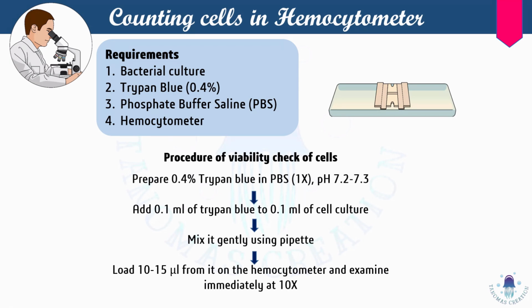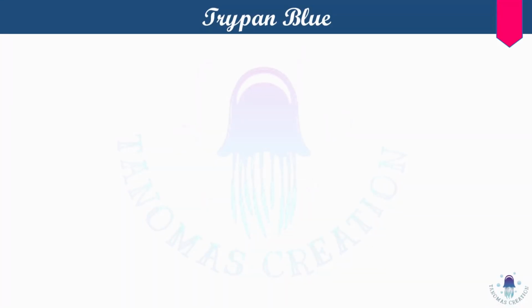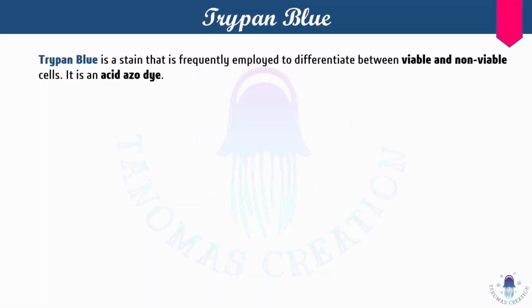Okay. So what does this Trypan blue do actually? Why are we using this Trypan blue? So this Trypan blue is basically a stain that is frequently employed to differentiate between the viable and the non-viable cells. So we can say that it distinguishes between the dead cells and the live cells if we simplify it. Okay. So Trypan blue is widely used for this purpose.